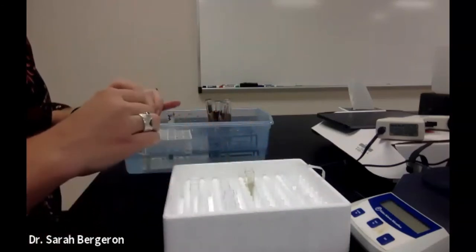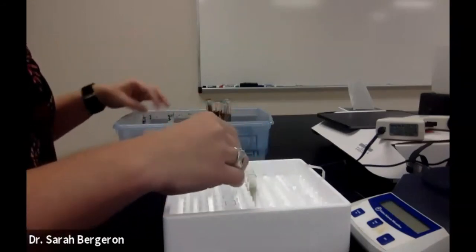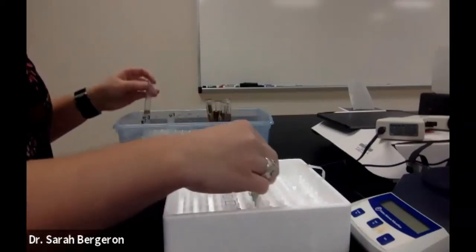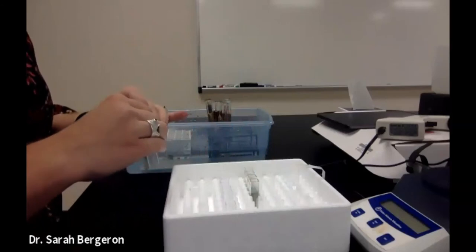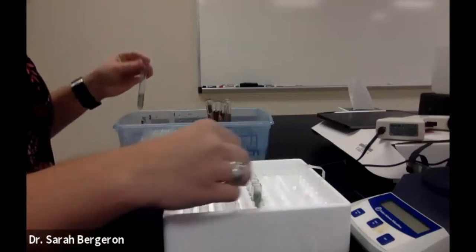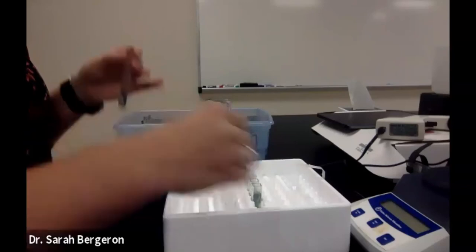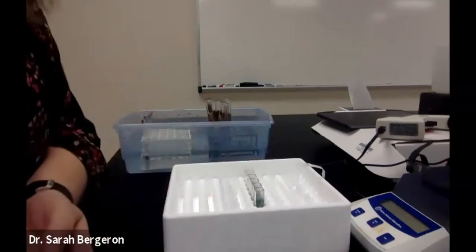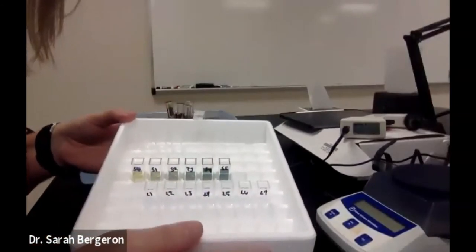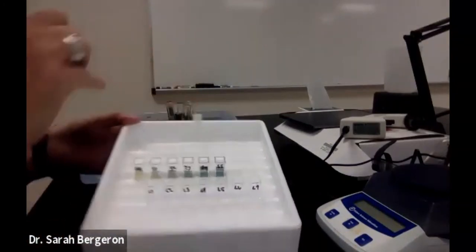2. 3. They look very nice in the cuvette. It's pretty easy to see because the cuvette box is white. I'll show y'all in a second how awesome the standards look. There we go. Okay, so let's see if I can show you. You see there the range in color? So 0 is kind of yellow, and then all the way over here is more blue.